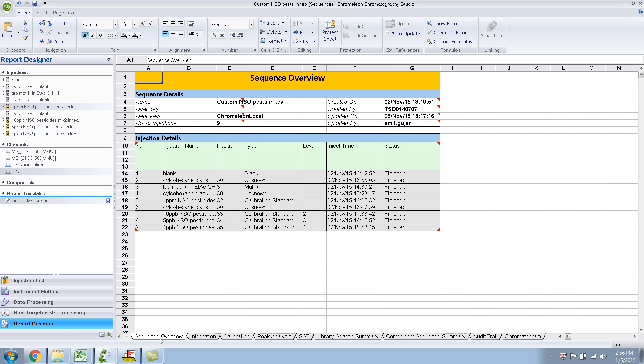So first is the sequence overview, it gives just an overview of your injection sequence, the name of the injection type, blank, blank or matrix or calibration standard.